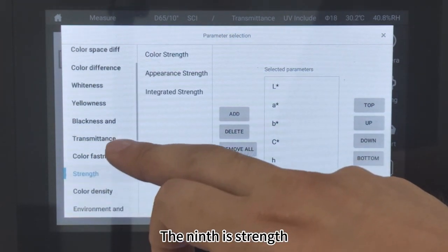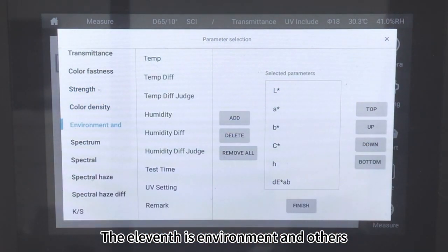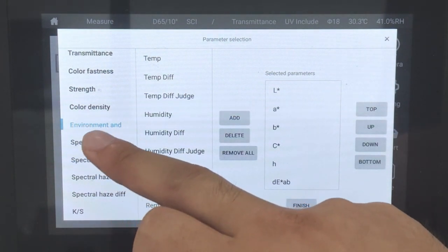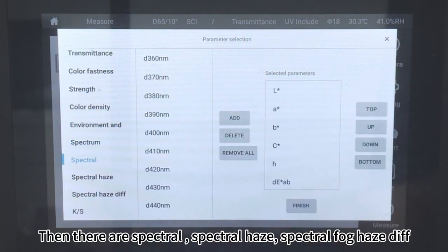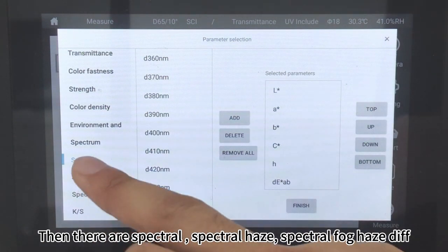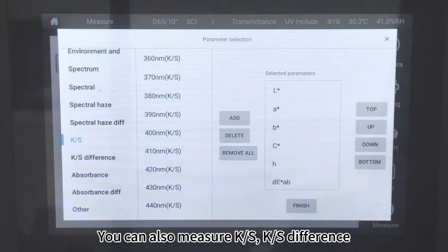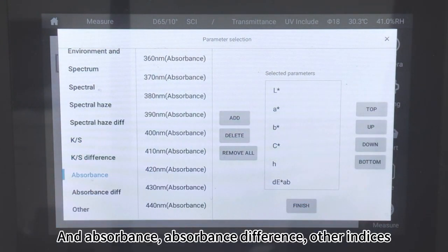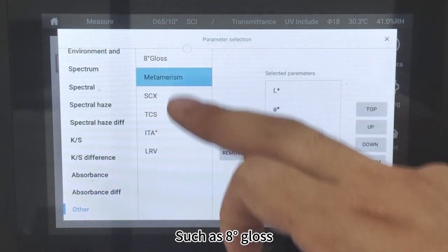The ninth is strength. The tenth is color density. The eleventh is environment and others. The twelfth is spectrum — values can be measured as spectrum, spectral haze, and spectral haze difference. You can also measure K/S, K/S difference, absorbance, absorbance difference, and other indices such as 8° gloss.